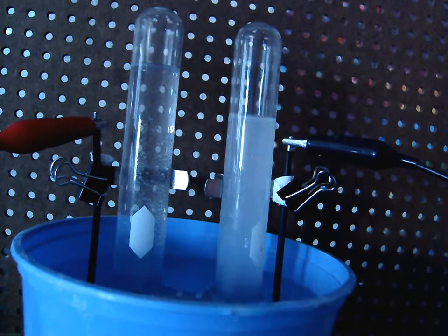The gases are pretty light, so as long as we held the test tube upside down, so the mouth was down, both the hydrogen and the oxygen would stay in the test tube. And then we could use a splint, which is basically like a popsicle stick. We could light it on fire, and if we put the lit popsicle stick underneath the mouth of the test tube containing hydrogen, it would pop. It would make a popping sound. And so we could do that to identify which one was hydrogen.